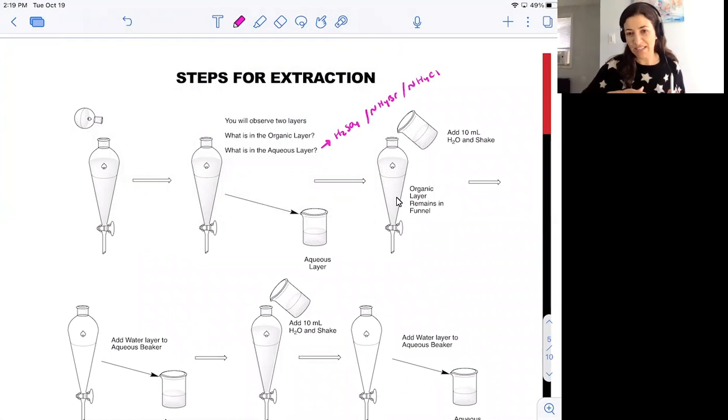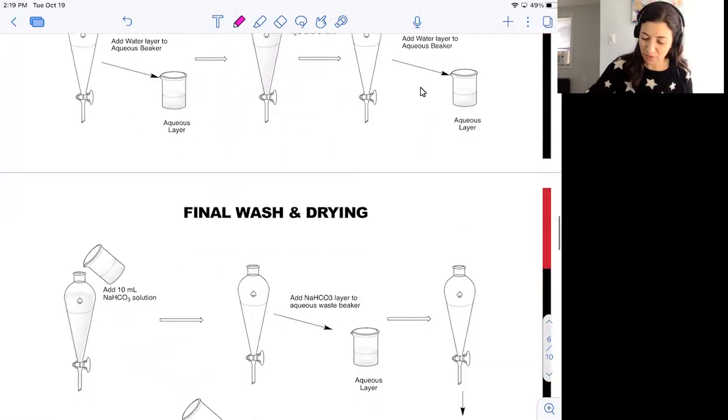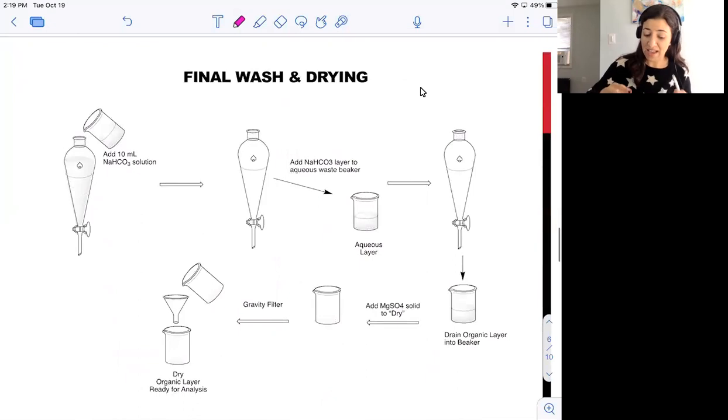The organic layer is then typically washed a couple of times. The washing refers to the addition of some extra water, shaking of the separatory funnel, and allowing the two layers to settle again, and collecting the aqueous layer and adding it to our initial water collection. This allows us to remove trace amounts of acid or salts that are lingering behind in the organic layer. It's really important to do this to be able to get a nice clean gas chromatogram.